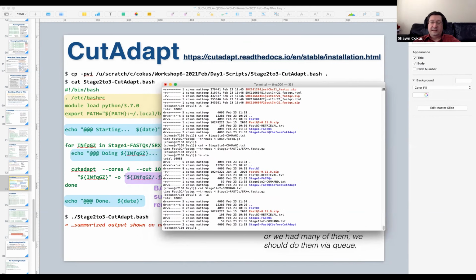So let's run Cutadapt. Now I've already given you a nice script to do this, and this script illustrates a bunch of more principles, which are nice. This time, instead of interactively running commands on the command line and then trying to record them later, the problem in bioinformatics is always reconstructing your steps at the end. You start a project, and 12 months later, when you're writing the paper and you've done 18 versions of the analysis, you're trying to figure out what the heck you actually put in the paper. You need to retrace your steps. You've got to leave little breadcrumbs all around so you can figure out how it went. That's the discipline for working.